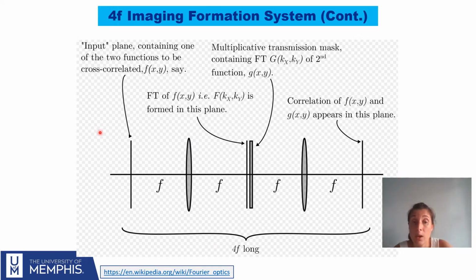And at the end of the day, what you need to know is, alright, this is your input, here you have the Fourier transform of your input, and this Fourier plane is usually the plane where we put an aperture, a pupil. The pupil is going to crop, it's going to filter the spectrum of your signal, and that's going to become our next image. And then what we're going to have at the end is the image of your filtered Fourier transform of your signal.